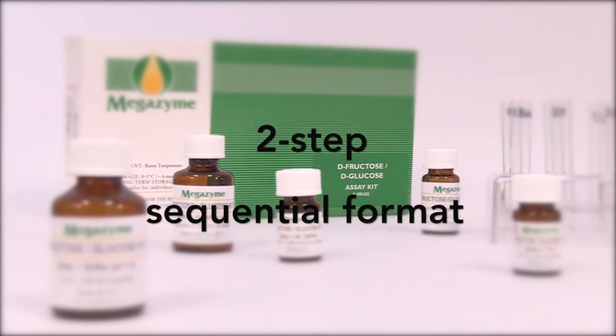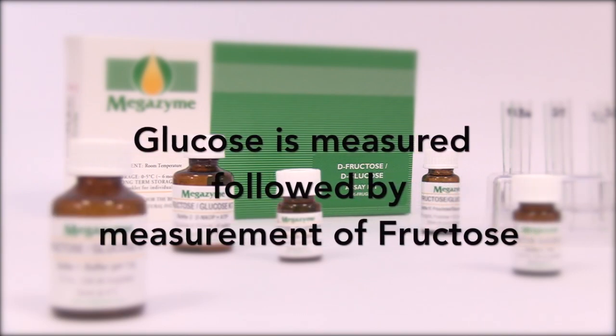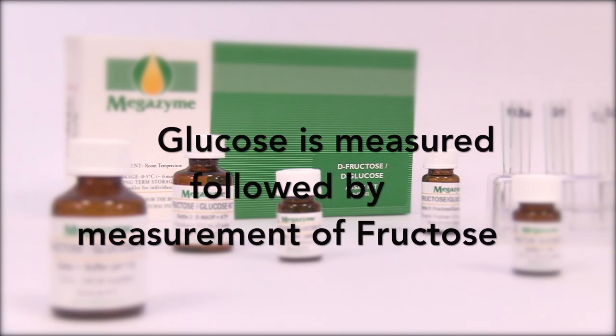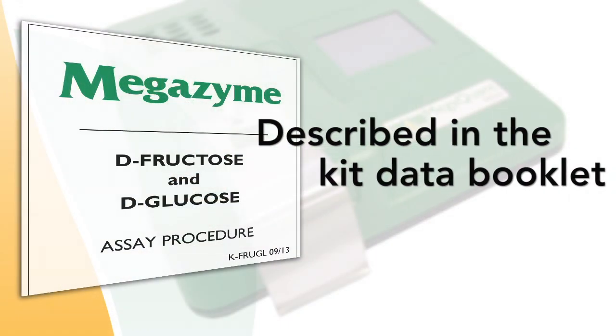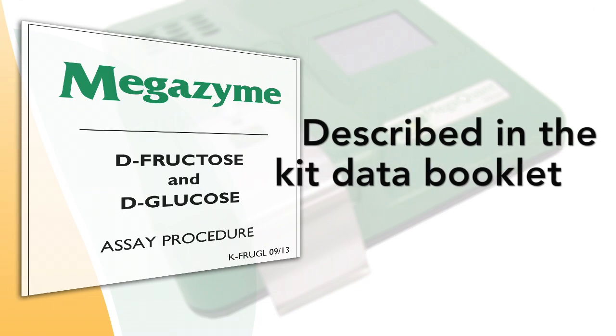This demonstration shows how to perform the assays of the fructose-glucose assay kit using a two-step sequential format, whereby D-glucose is measured followed by the subsequent measurement of D-fructose. The kit components should be prepared as described in the kit data booklet, and once prepared, they are ready for use in the manual assay procedure.